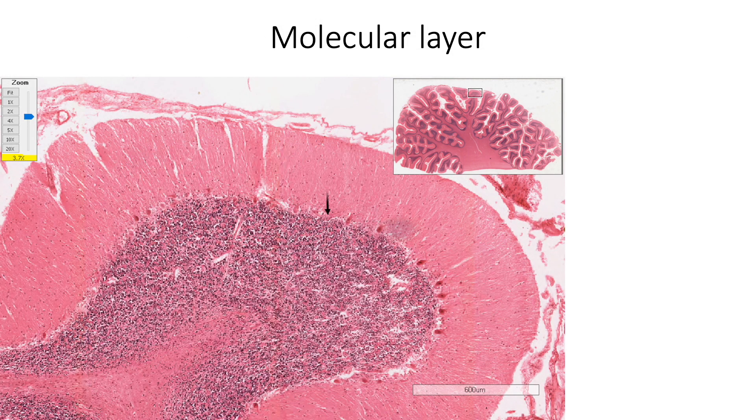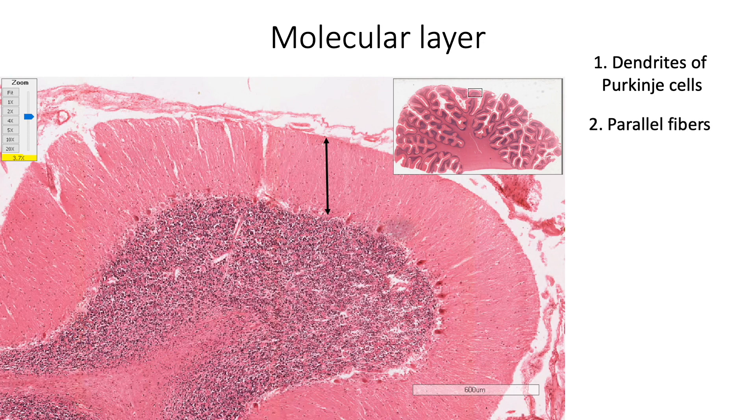Molecular layer is the pale staining superficial layer, which mainly consists of neural processes and it has very few cells. The neural processes found in this layer include dendrites of the Purkinje cells, parallel fibers which arise from the axons of the granule cells and the climbing fibers.